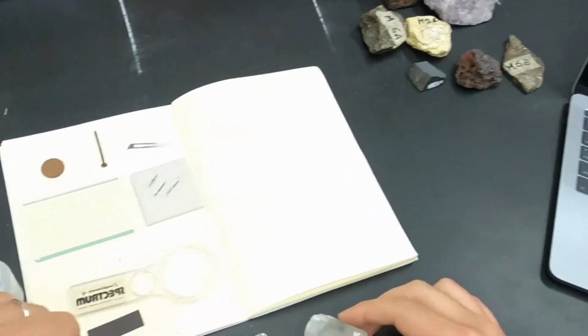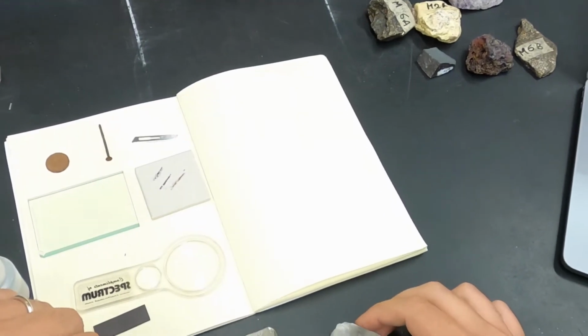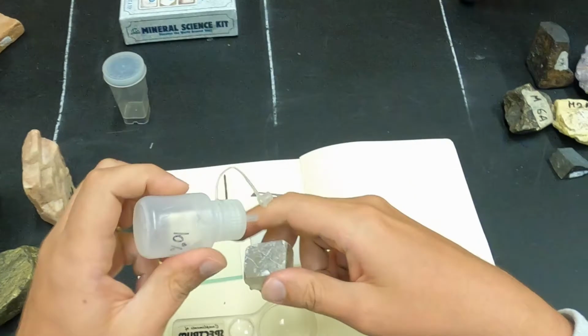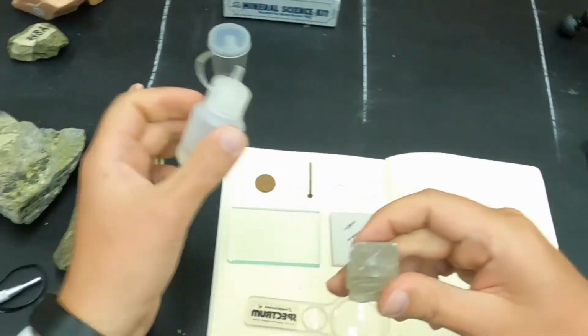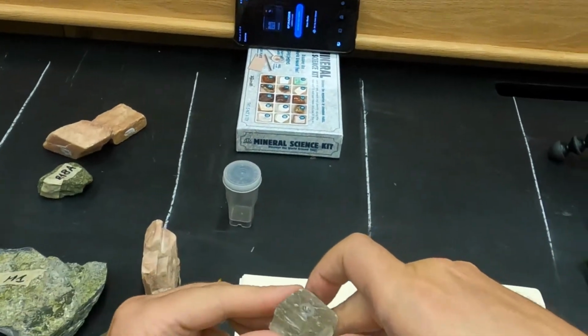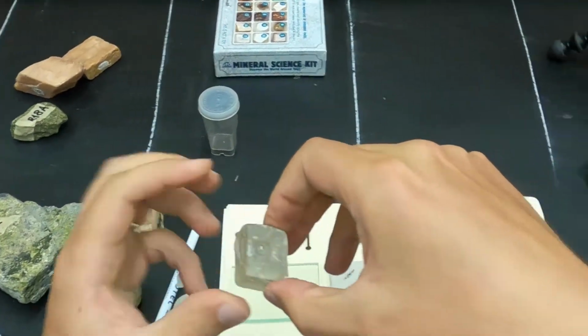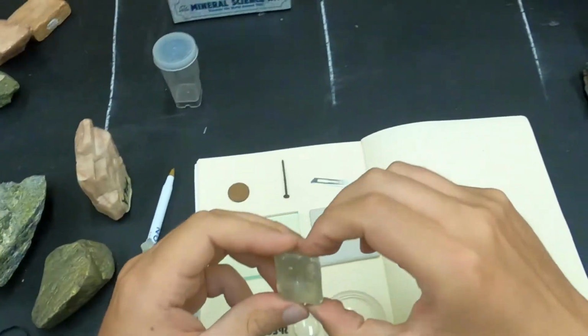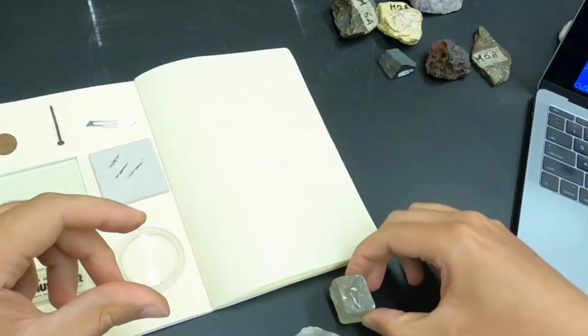The same should be true if this other crystal is calcite, so we can test that too, and we will see that we have a very similar effervescence. Of course, you have to be careful, do not touch acid with your fingers, but it's pretty reactive.